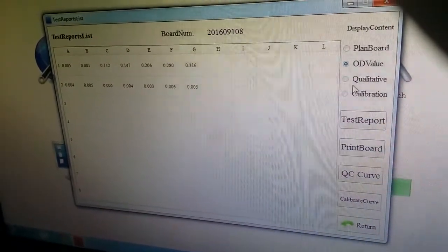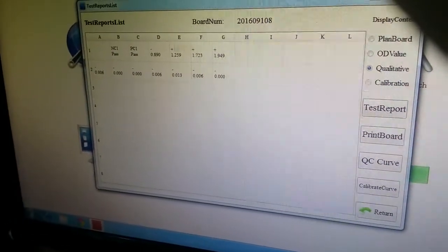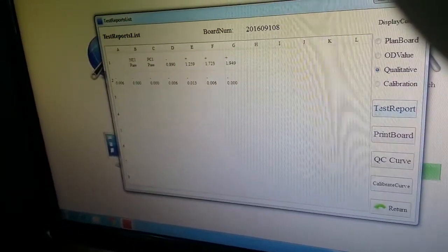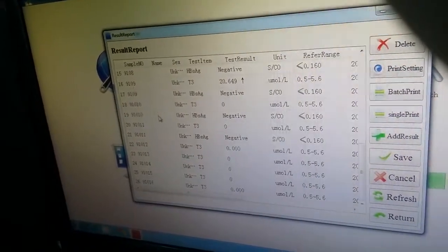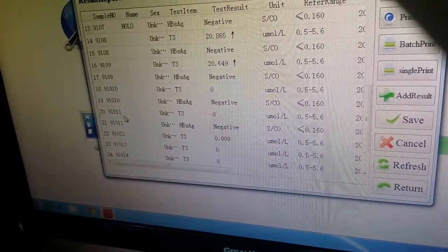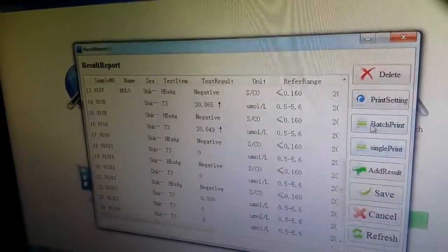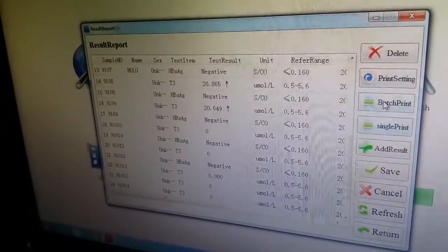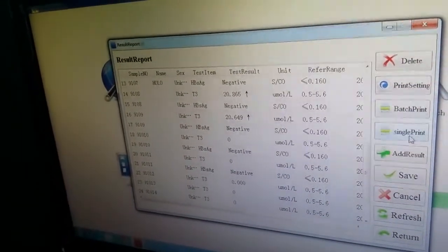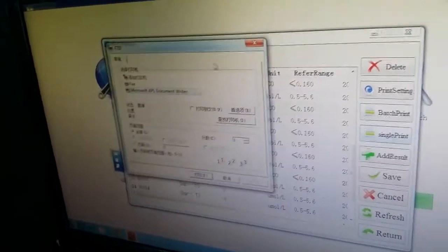Now from the right panel, press Quality Active to view the results we obtained. If we want to print the report, go to Test Report and we will get the results. From the right corner you can choose Batch Print or Single Print. Batch Print means you can print multiple reports at once, and Single Print means you print one report at a time. If we choose Single Print, it will be printed.